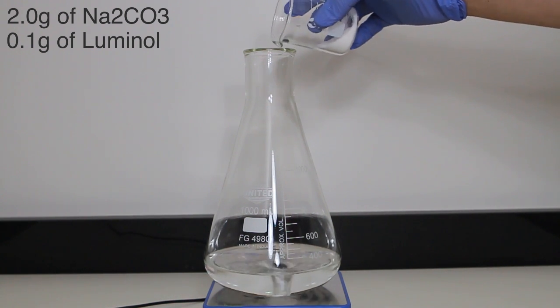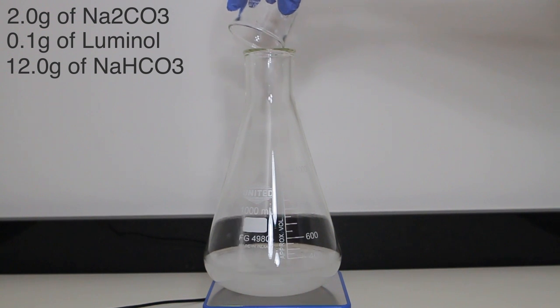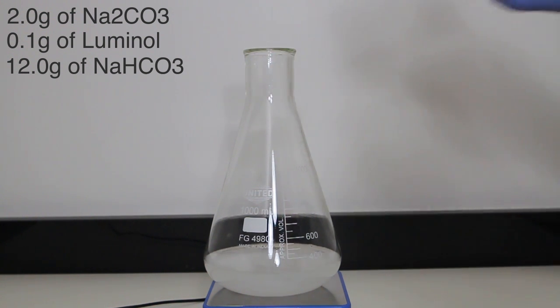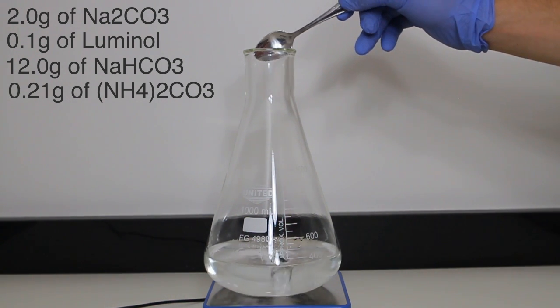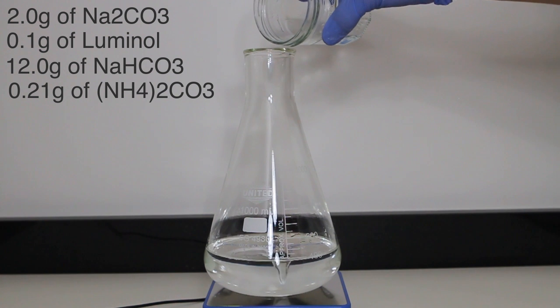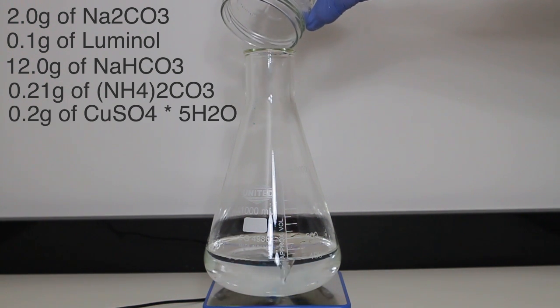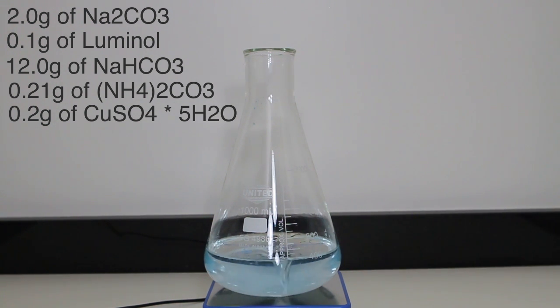Once the luminol is completely dissolved, we can move on to dissolving 12 grams of sodium bicarbonate. Once that beaker is washed, 0.21 grams of ammonium carbonate is dissolved. Ammonium carbonate smells heavily of ammonia and must be handled in a well-ventilated area. After that dissolves, I break off some of the chalcanthite to measure out 0.2 grams. Once that is added, the solution begins to turn more blue as the chalcanthite dissolves. As soon as that is dissolved, the solution is raised to 500 milliliters with distilled water. Solution 1 is now complete.